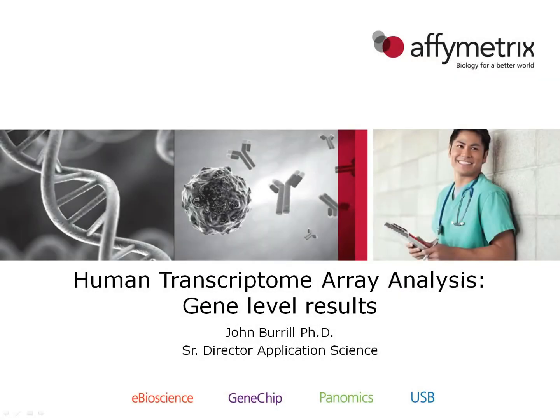Welcome to this webinar in which we're reviewing the standard gene level results that come from doing the analysis of the human transcriptome array in the Transcriptome Analysis Console, or TAC, software.